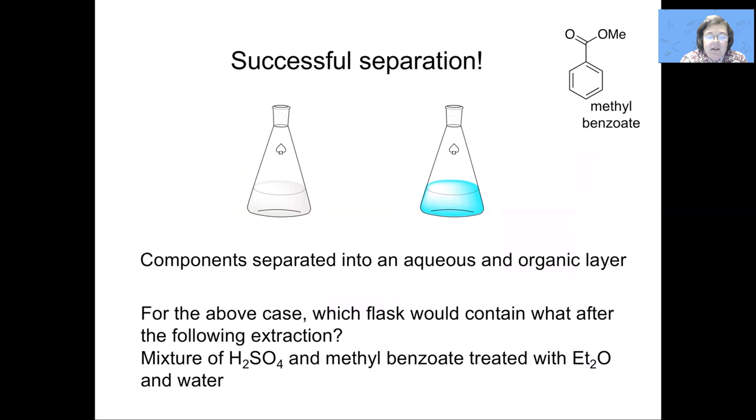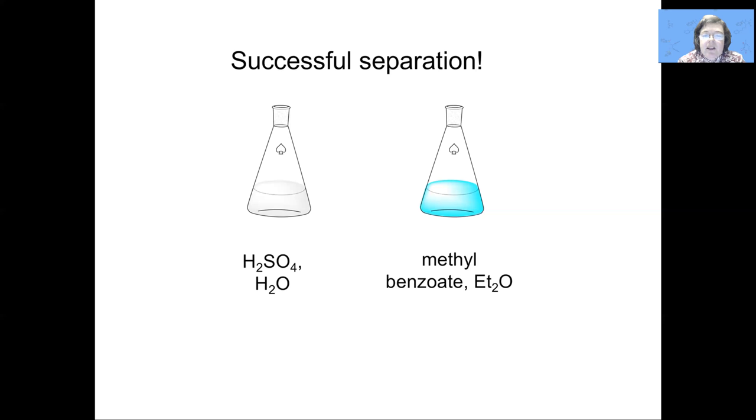We have our successful separation. We have our aqueous layer in one flask and our organic layer in another flask. If we had done a separation of sulfuric acid and methyl benzoate by using diethyl ether and water, the blue layer, which was our top layer, would have contained the diethyl ether plus methyl benzoate, whereas the water and sulfuric acid would have ended up in the aqueous layer. So we've successfully completed a separation of two different compounds into two different solvents: water and diethyl ether.